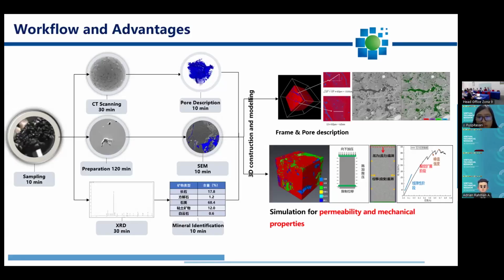One is to measure the pores and pore throats in the 3D model and calculate the porosity, and also calculate the pore distribution, which is not just the porosity, but a very detailed distribution of different sizes of pores. How many big pores, what percentage of big pores you have, what percentage of small pores you have, which is critical. I'm going to talk a little bit more in detail.